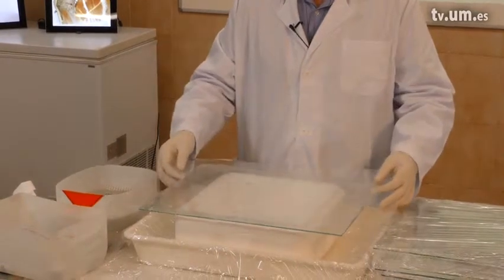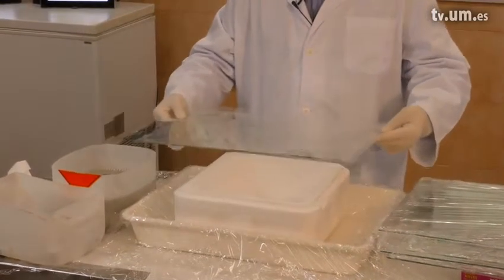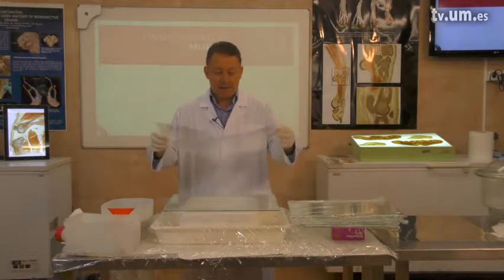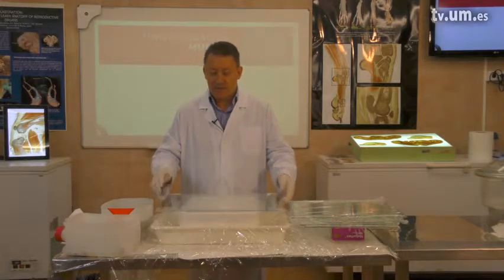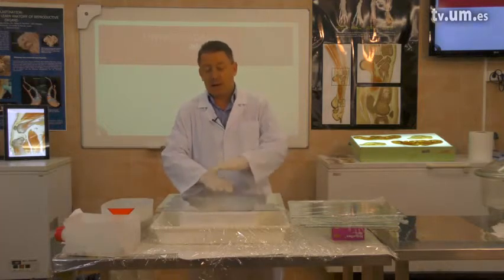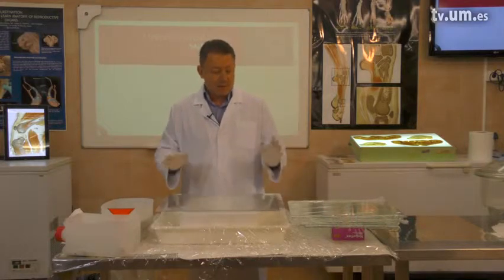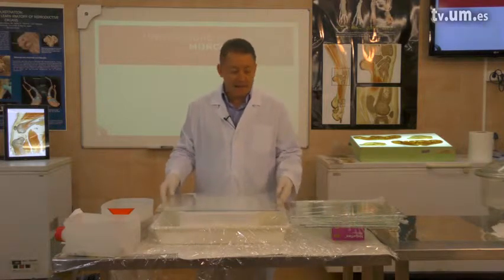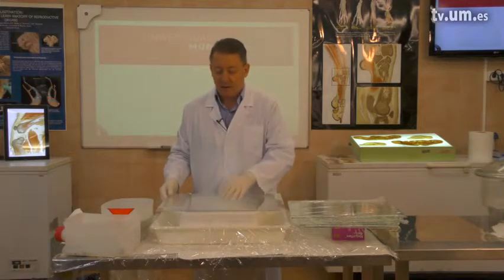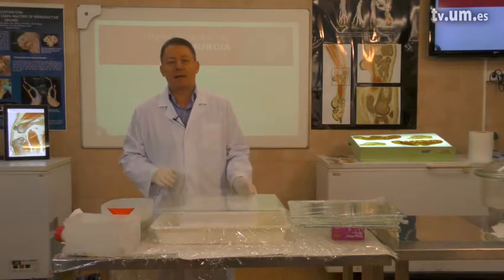We start assembling the sandwich by placing on the styrofoam block a glass plate, then a foil. Then we take the specimen, place it here, put another foil, and another glass plate — building up a sandwich. The basic equipment is: covering foil, glass plates, polystyrene foils, and our impregnated slices.